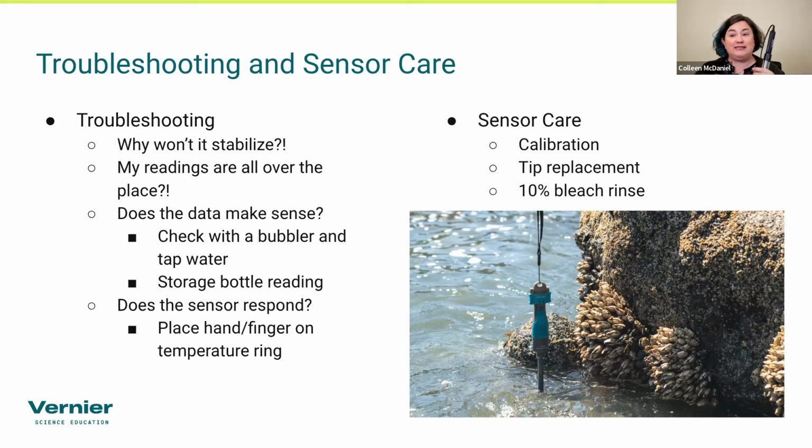you're going to need the world's tiniest paper clip to go in and press down the reset button on here. And you should have the switch put on %. And as you're looking at your interface, you hold that reset button down until the readings drop to 0. Once they drop to 0, you release, and it can take a couple minutes, but the readings will then come back up to 100% or around, and then just let it sit for about a minute to fully equilibrate, and then you're good to go.